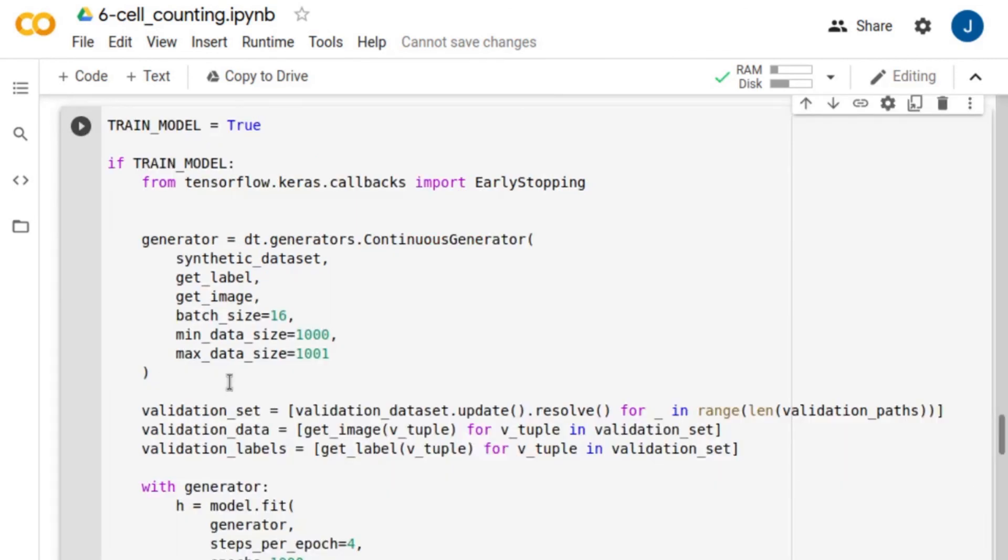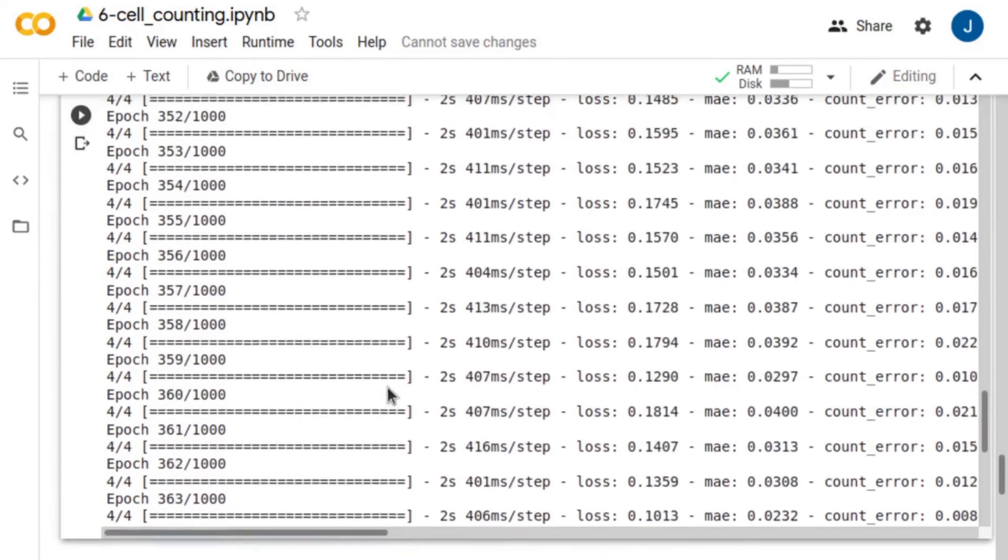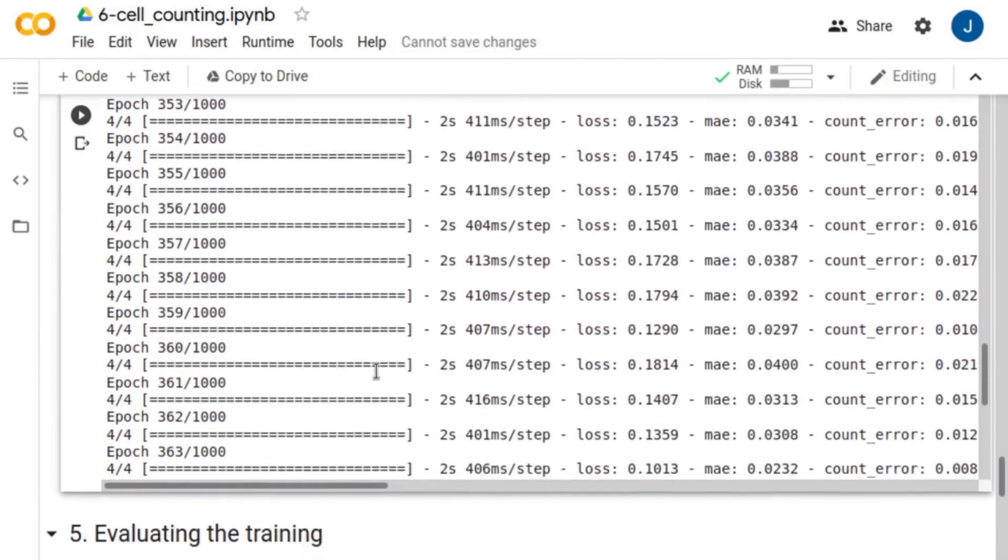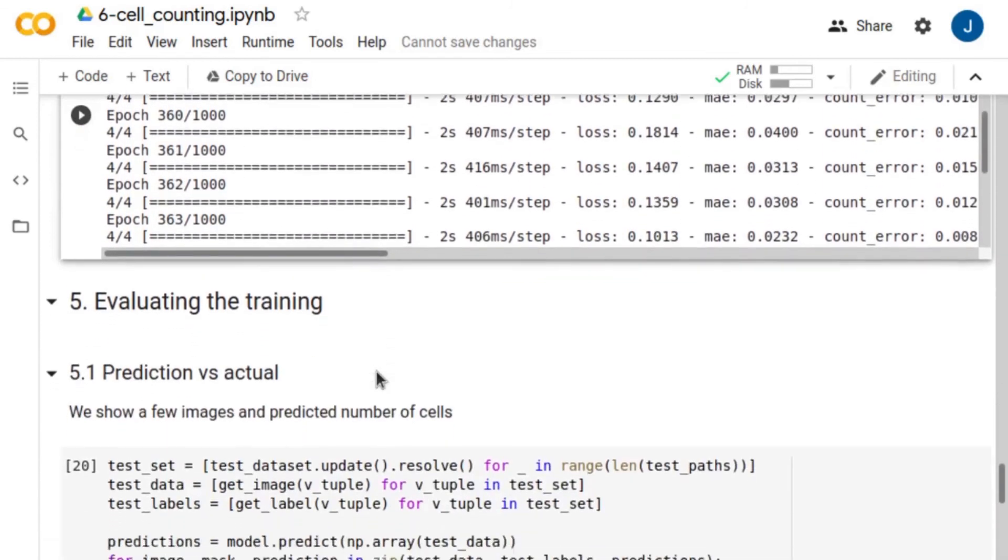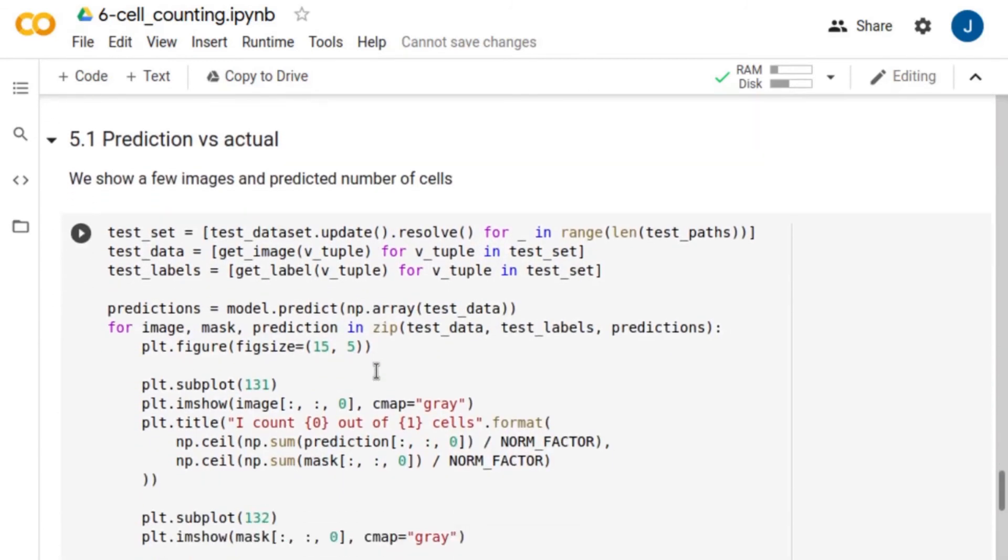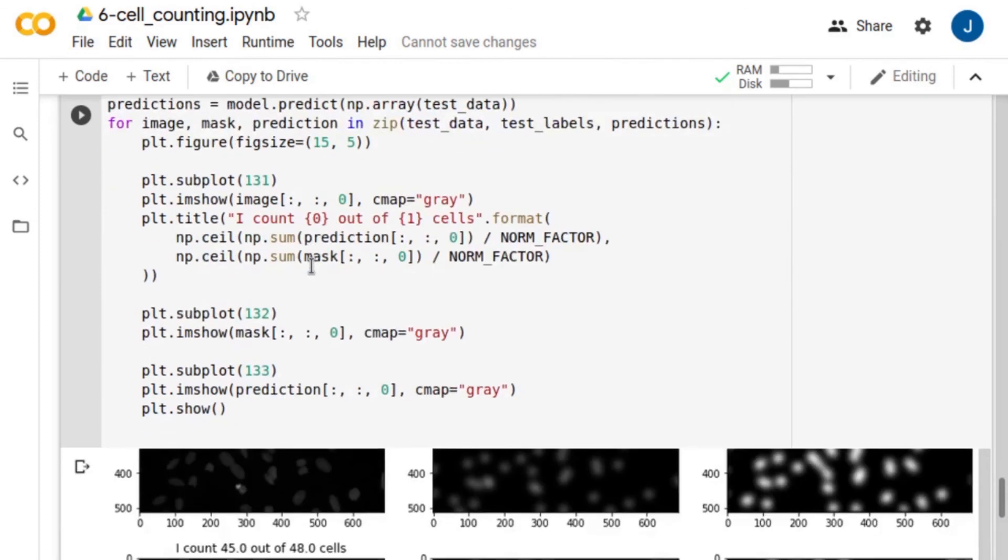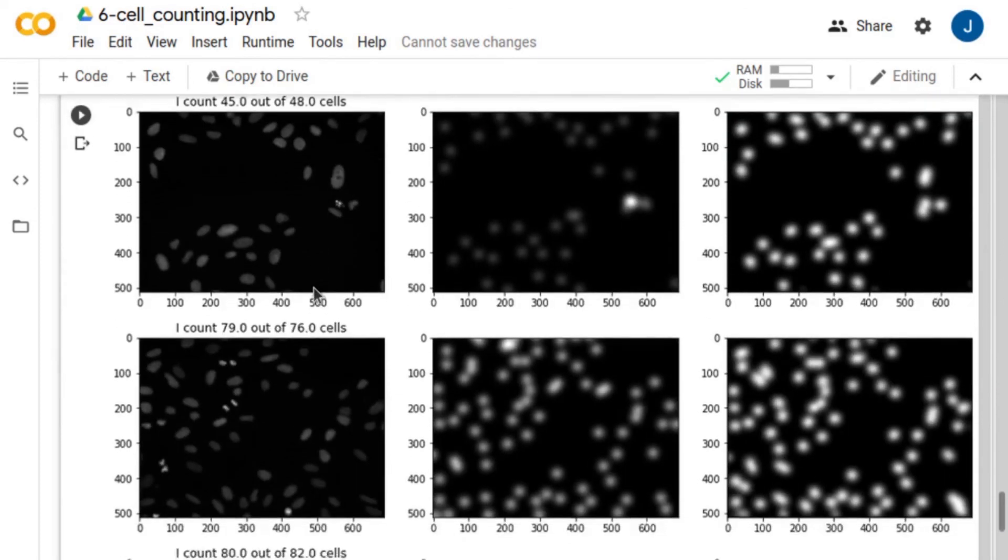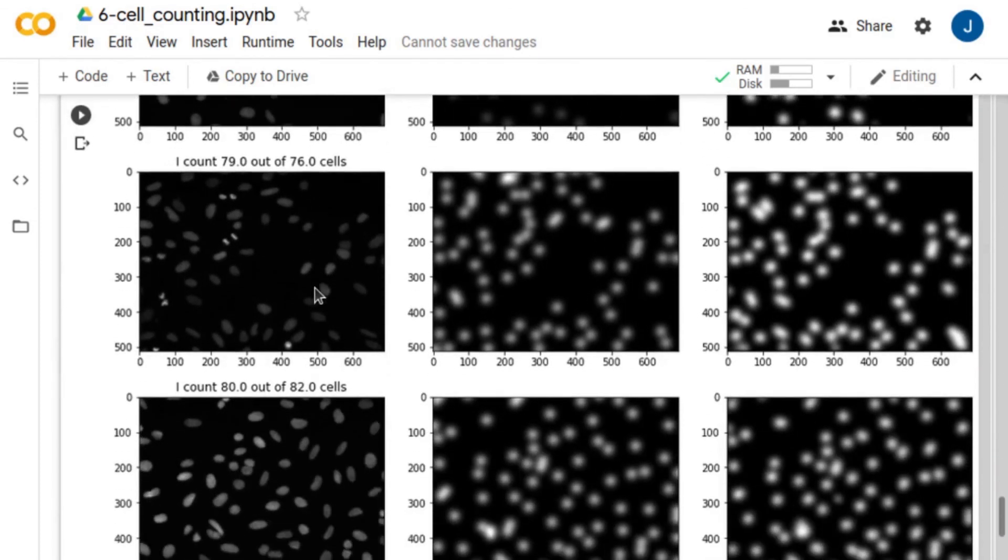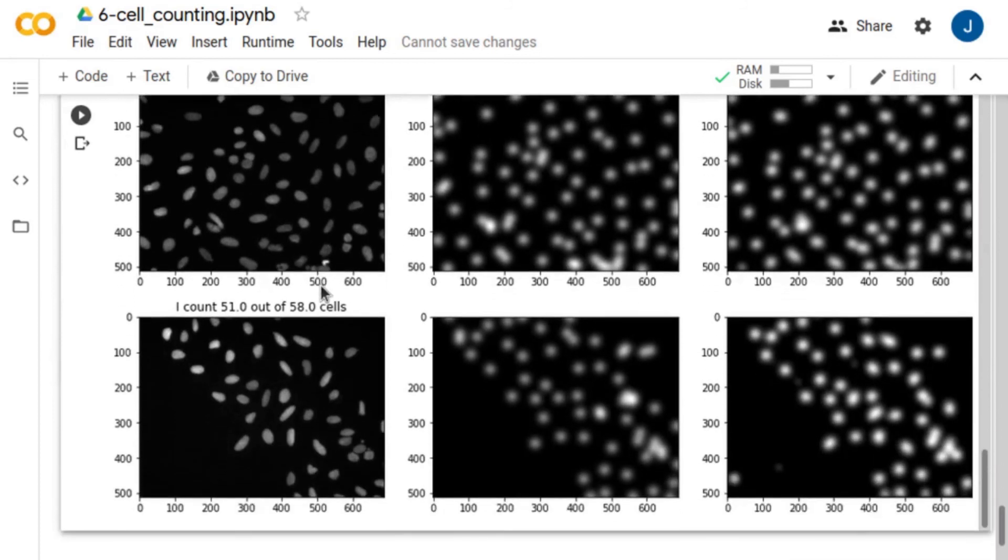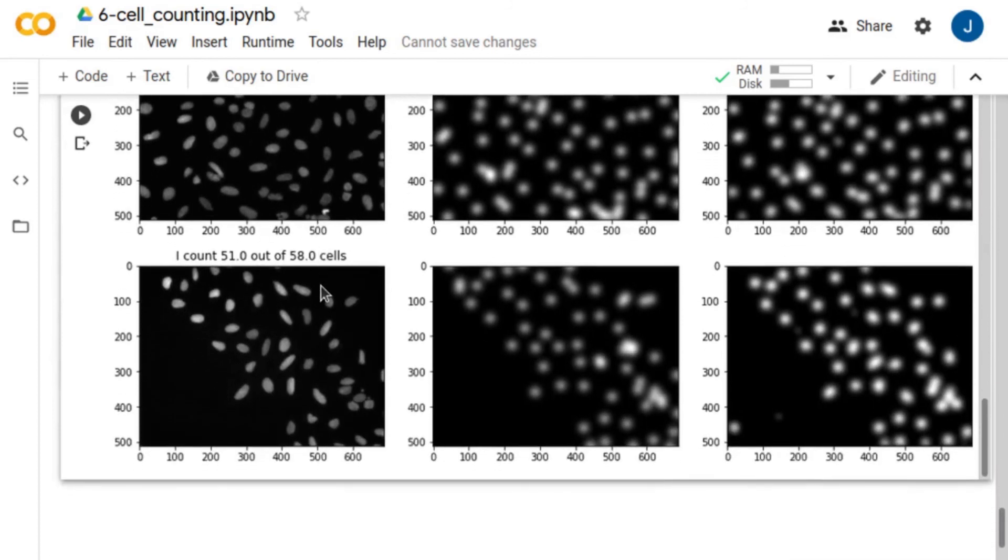After the training is completed, we can visualize the training and validation loss. Now, we evaluate the trained network using the test dataset. Here we show the cell images and the predictions of the neural network.